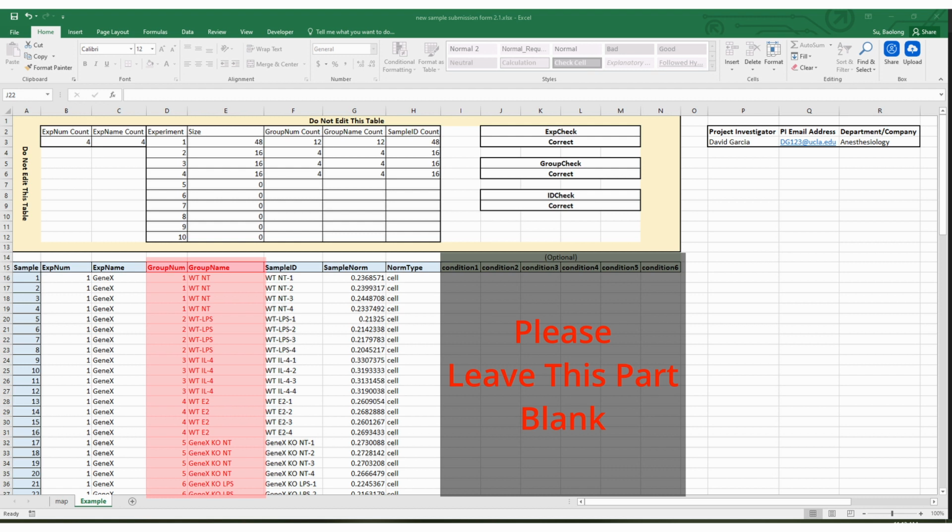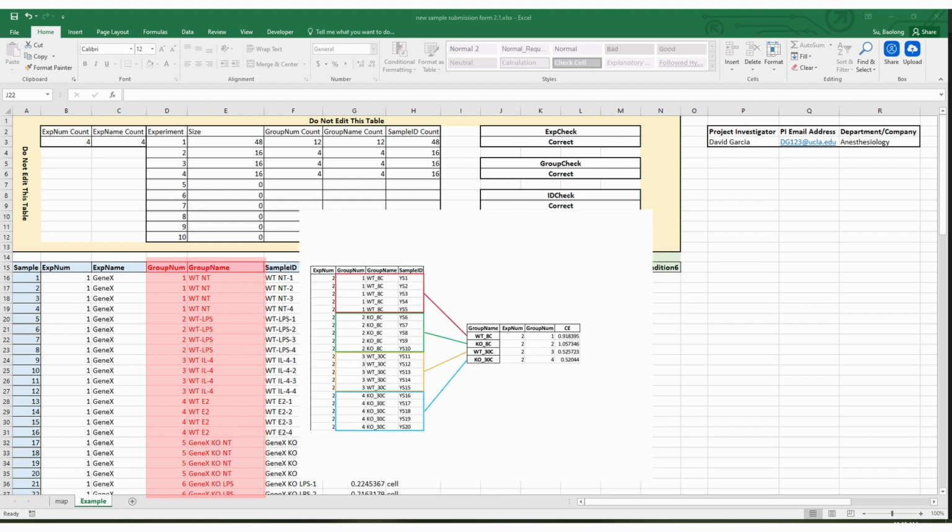Unlike the experiment number, the group number doesn't need to be ordered and can be mixed up in any order. The group name should be the same for each sample with a given group number. These are used to parse out data to compute group average, variance, and to make plots. The groups in the class total plots are ordered by group number, so you can assign group numbers based on the order you want to see them in the plot.